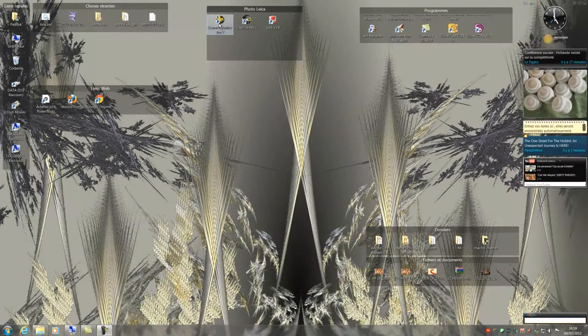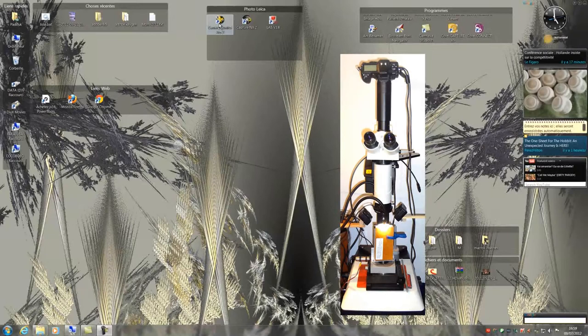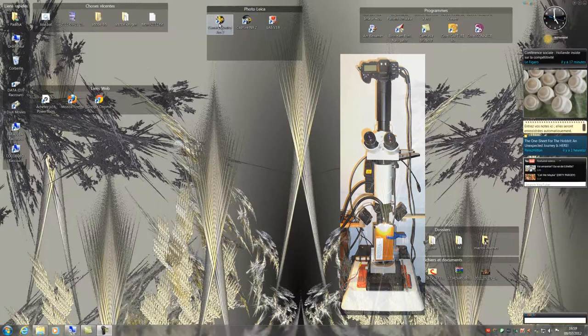We will now make our first picture of a sample. I put a sample under the macro zoom. I turn on the lights and the flashes.